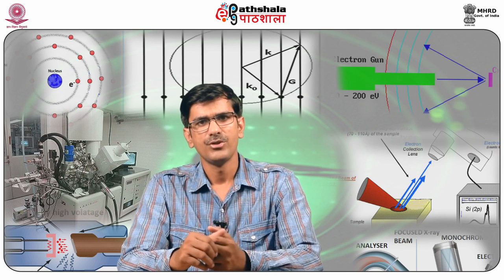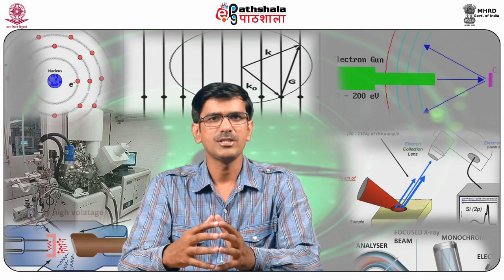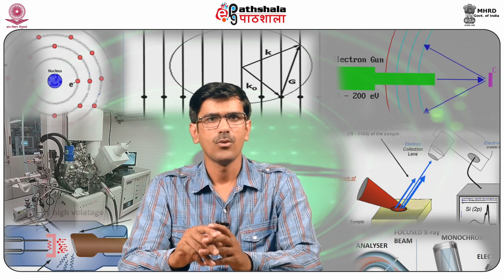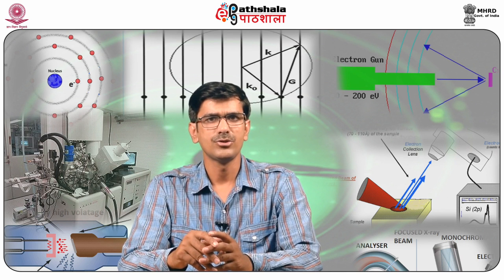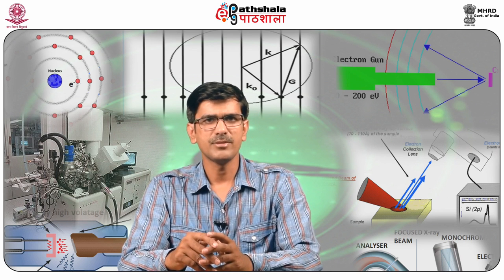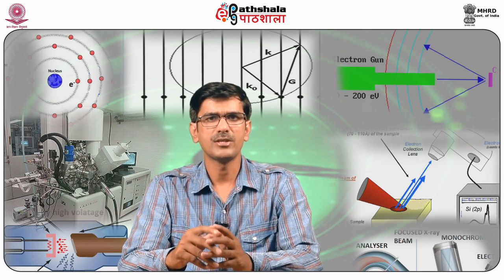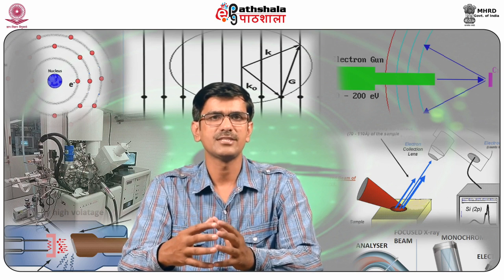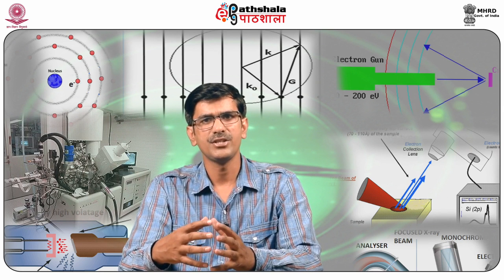As said before, the X-ray diffraction pattern is a fingerprint of the periodic atomic arrangement in a given material. The interaction of incident rays with the sample produces constructive interference when conditions satisfy Bragg's law, that is n lambda equals 2d sine theta. Using the mathematical technique of Fourier transform, the recorded series of two-dimensional diffraction patterns is converted into a three-dimensional model of electron density. The first step in data processing is indexing the reflections.